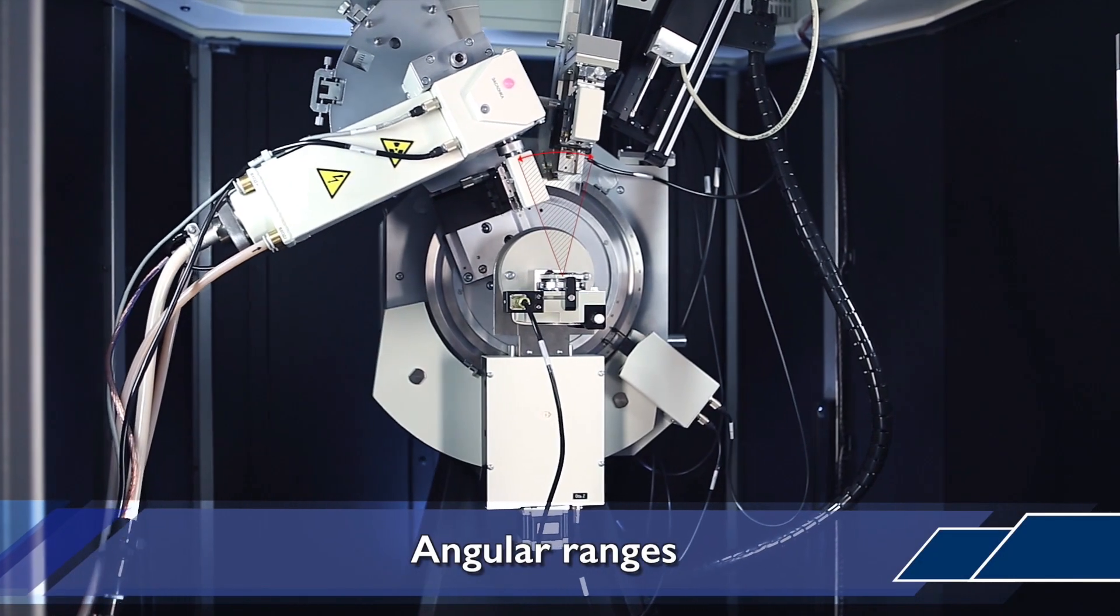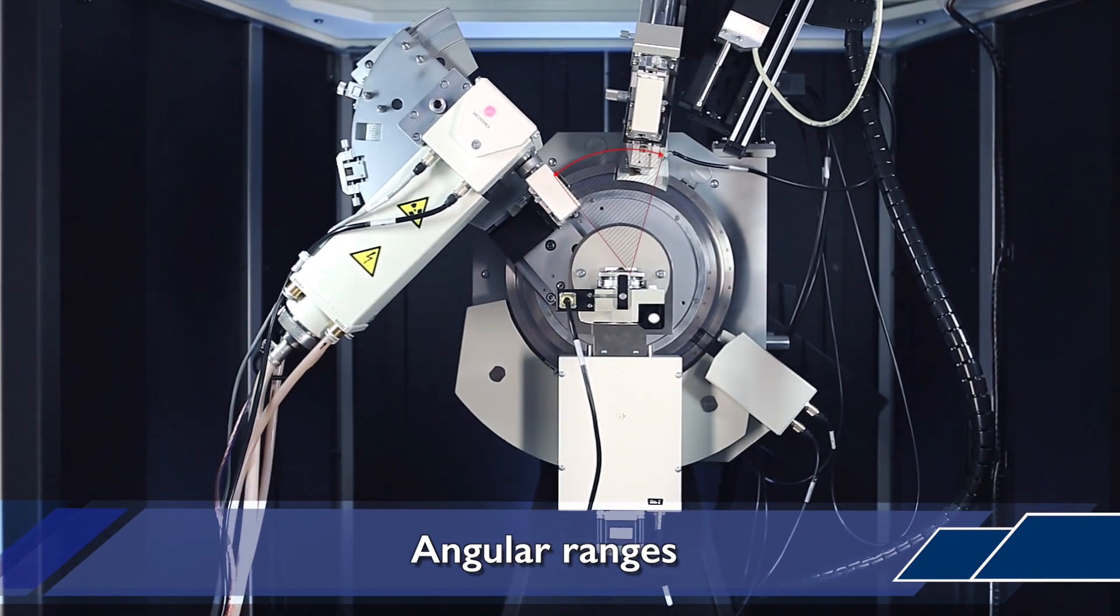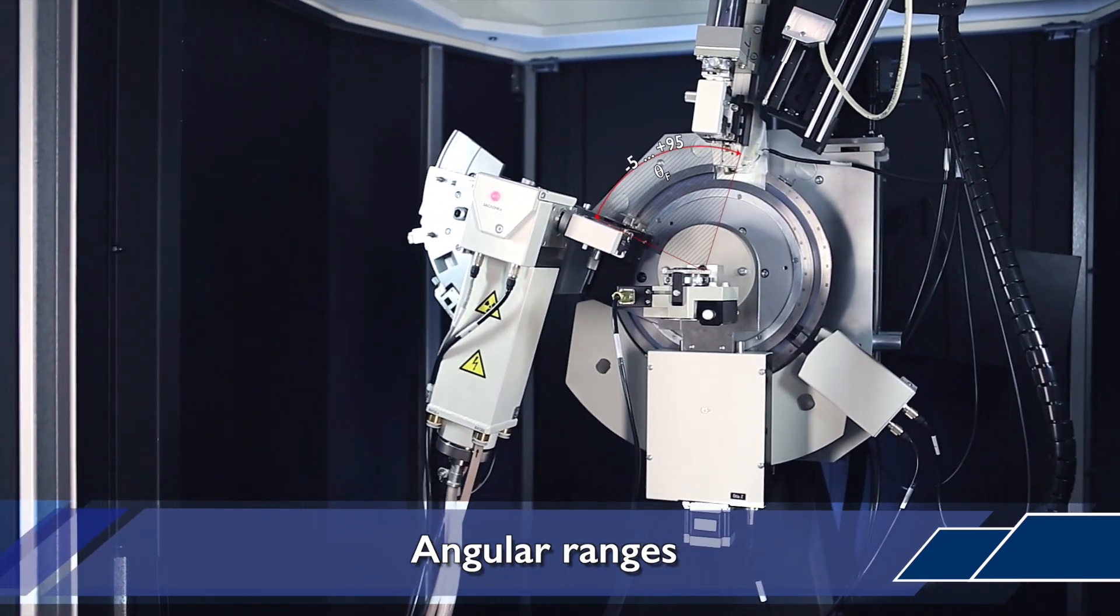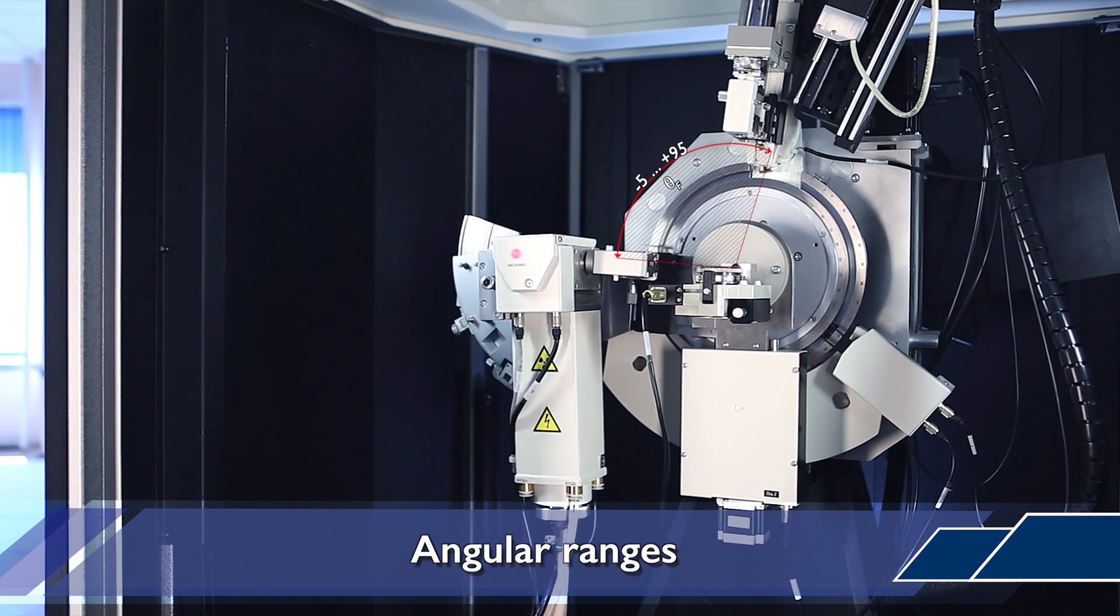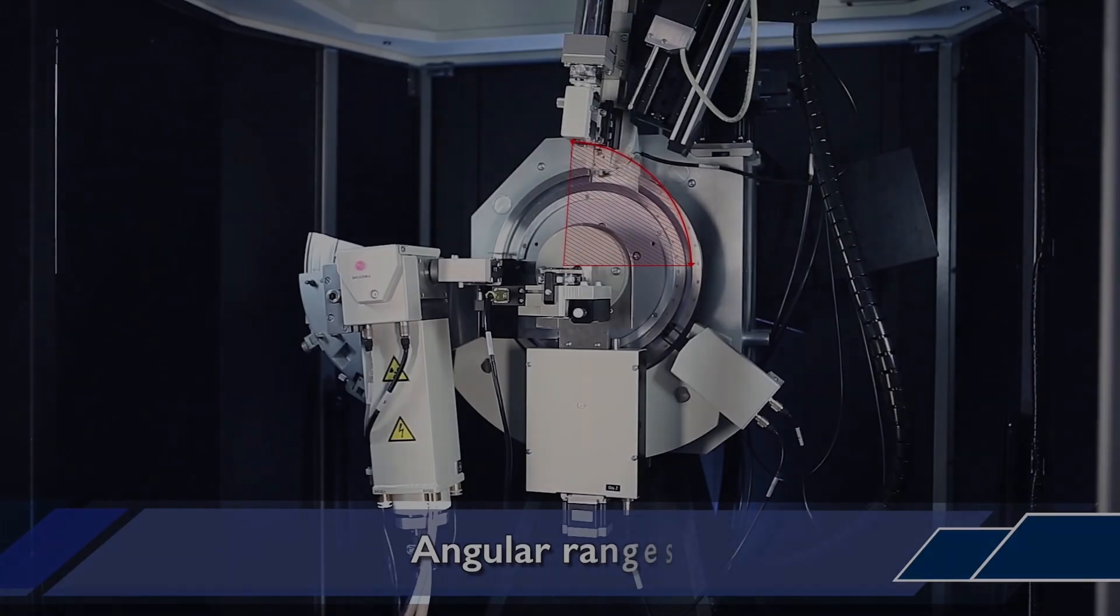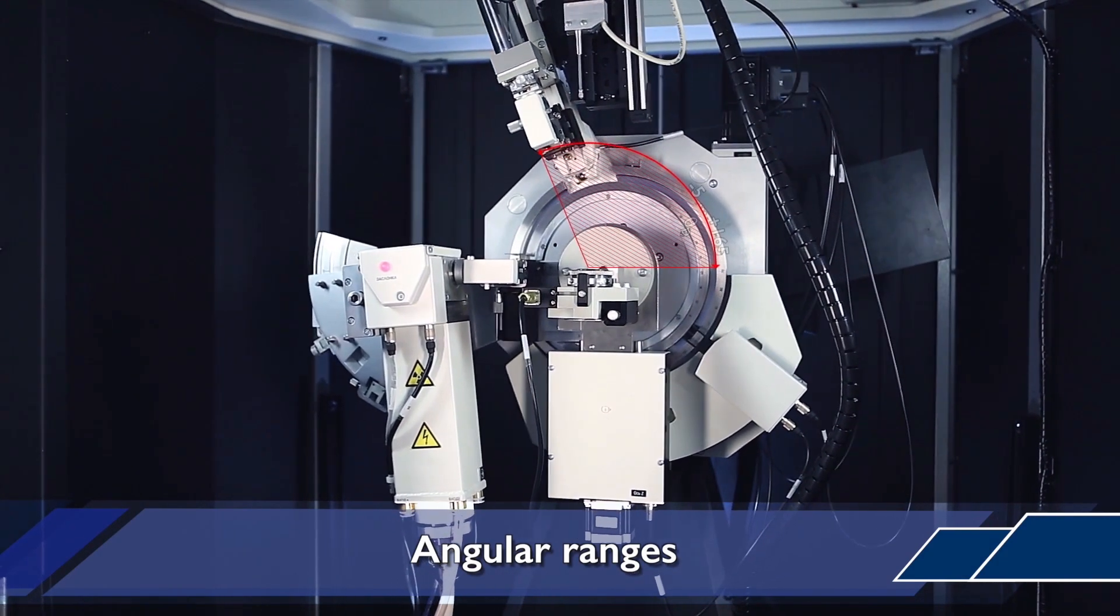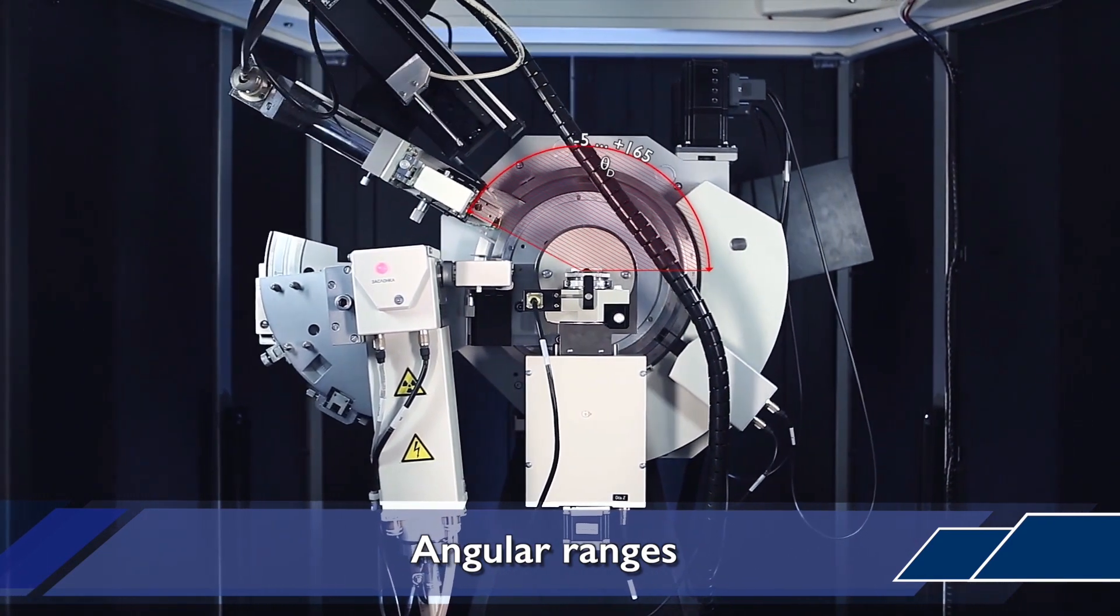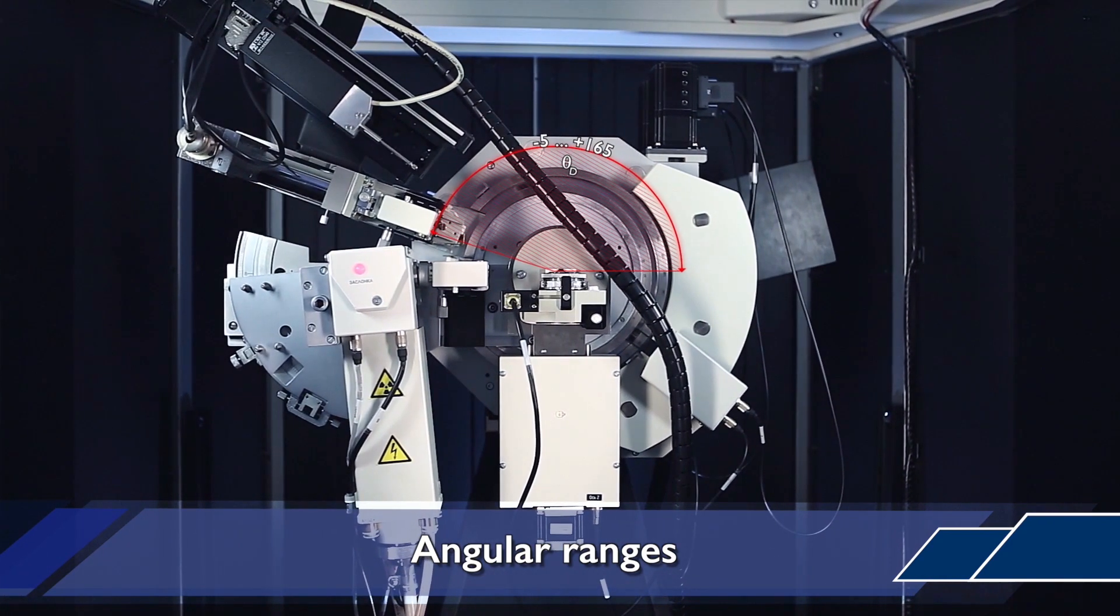Independent angular movements of X-ray tube and detector in wide ranges provide different techniques of X-ray diffraction studies. For example, small-angle X-ray scattering, grazing incident diffraction, analysis of residual stress, texture or single crystal orientation.